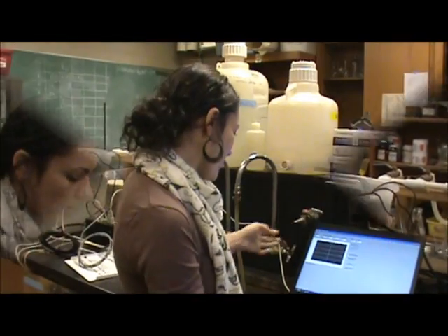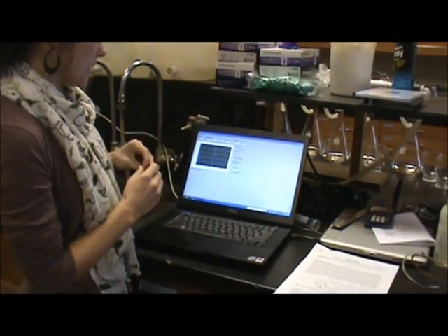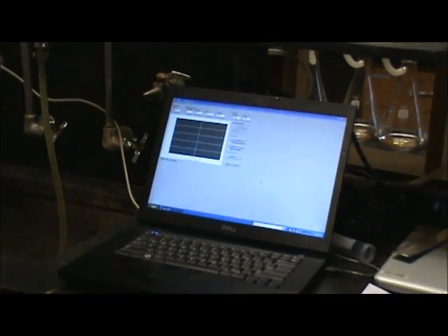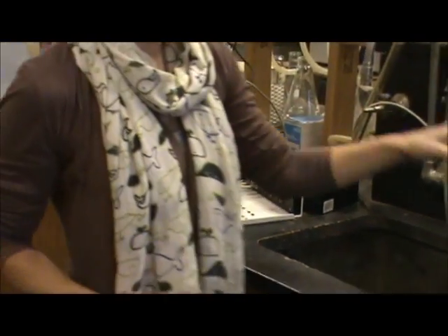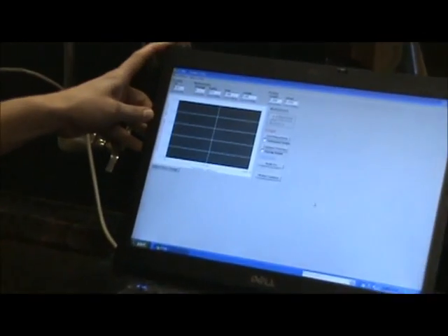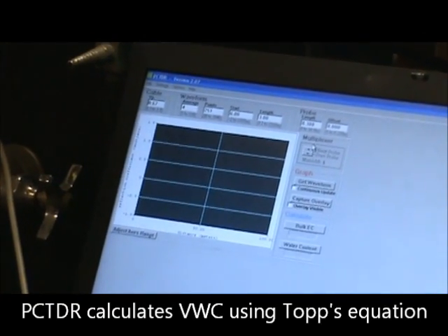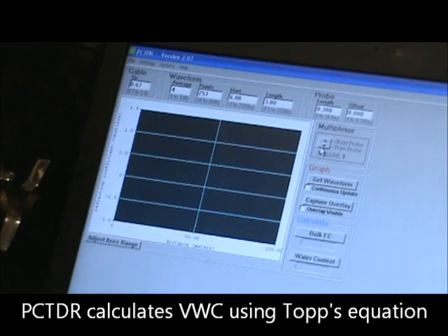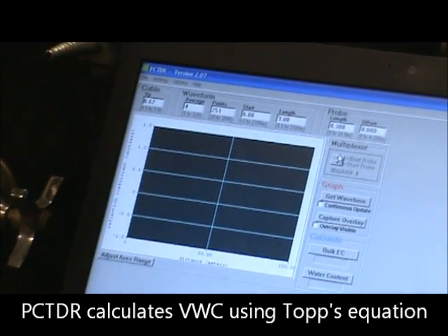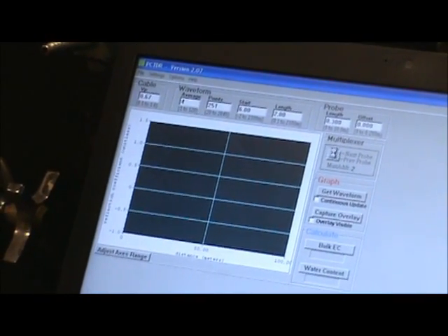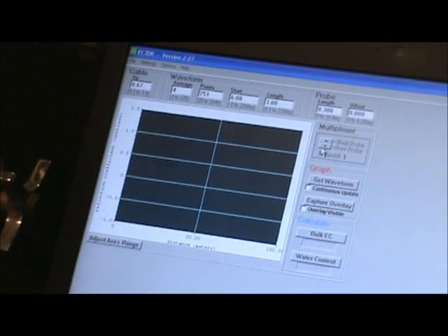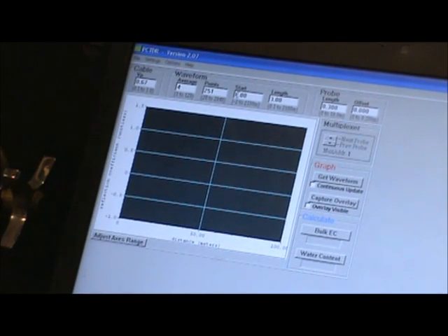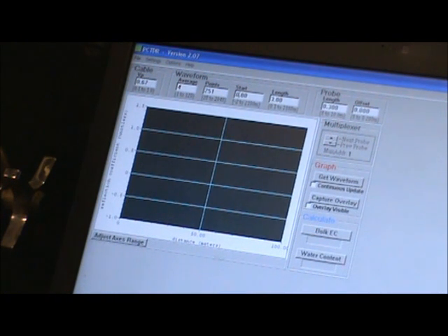Okay, to get the volumetric water content from the TDR probes, we have them attached to this data logger. When we pulled up on the screen, this is a PCTDR program, and what we're going to do is we're going to make sure it's on probe 1. And we need to find the disturbance in the signal.